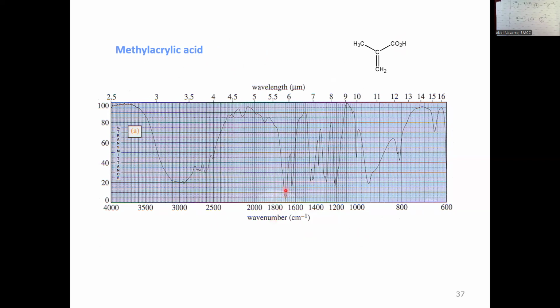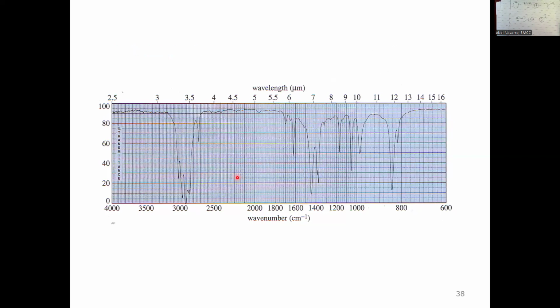That is C double O. That is C double C. This is the C double C. This is C double C. CH sp3, I cannot see it, unfortunately. What else is here? I see a double bond. Hexadiene, see? Diene is an alkene, double bond.